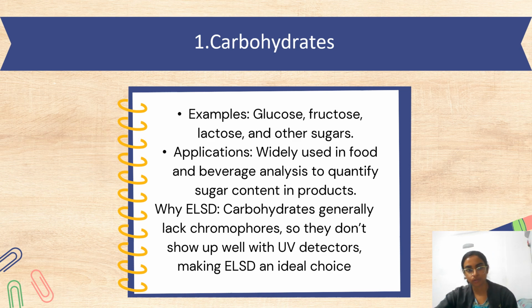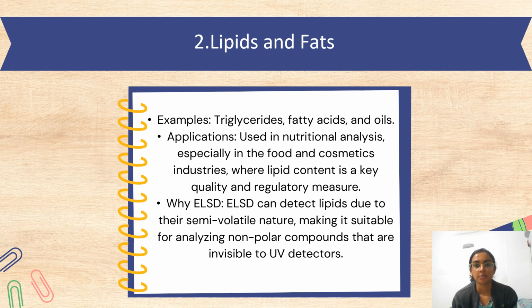Second is lipids and fats. Its examples are triglycerides, fatty acids, and oils. Its application is that it is used in nutritional analysis, especially in food and cosmetic industries, where lipid content is a key quality and regulatory measure. Why only ELSD here? ELSD can detect lipids due to their semi-volatile nature, making it suitable for analyzing non-polar compounds that are invisible to UV detectors.